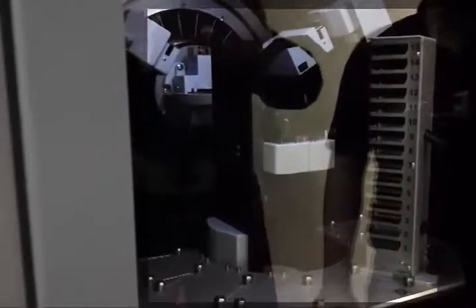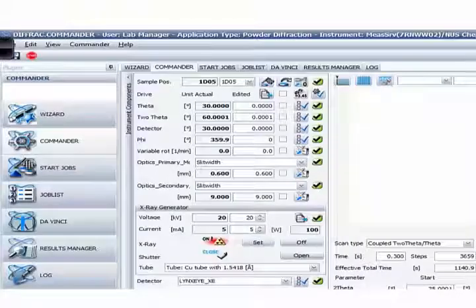You can see now the grabber is grabbing the sample holder, going back, and putting it onto the platform. Then the platform will rise up and this will lock the sample. From here onwards you can do your measurements — you can set your theta and two-theta angle.